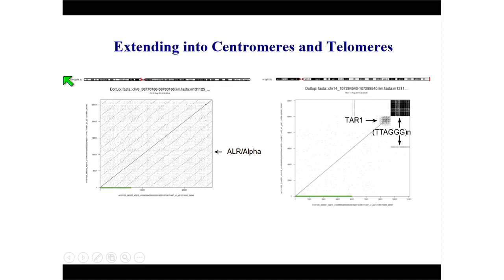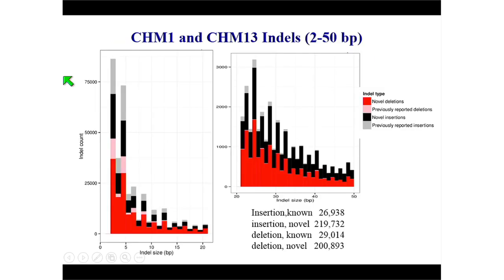And the same goes for the ends of chromosomes. So shown here is the end of chromosome 14. There's this telomere-associated repeat sequence, and then the TTAGGG sequence, which is diagnostic of the end of a chromosome. So this technology, or technologies like this that continue to build on read lengths, I think are exciting, because they'll get us to the point in this field where I think it will be possible to get complete sequence and assembly of a chromosome from tip to tip. We're not there yet, and there are particular problems around these super large repetitive regions of the genome.